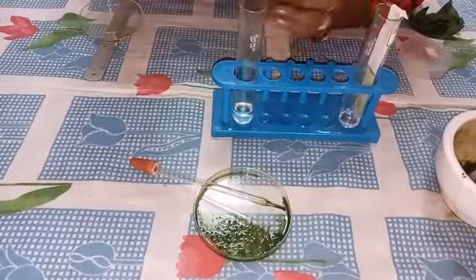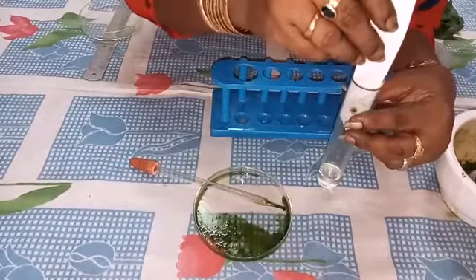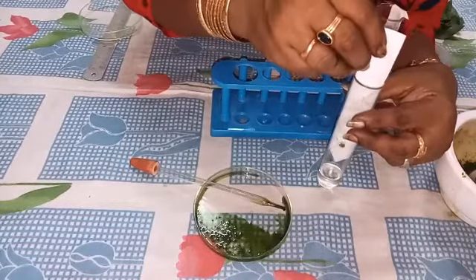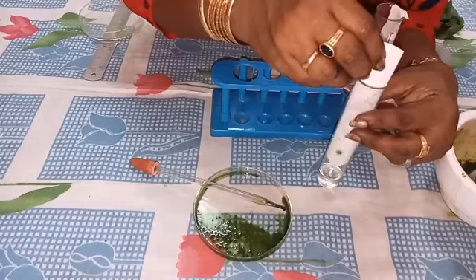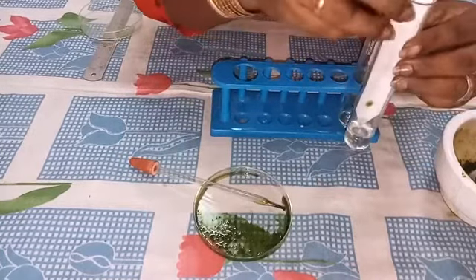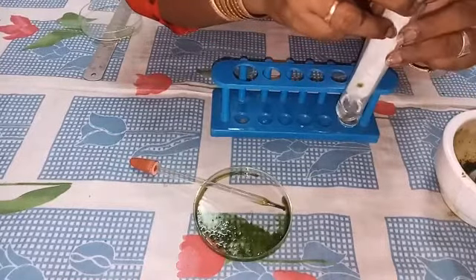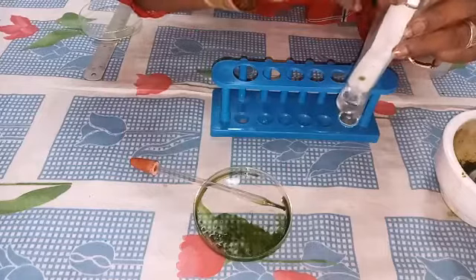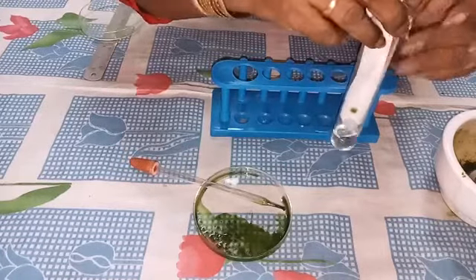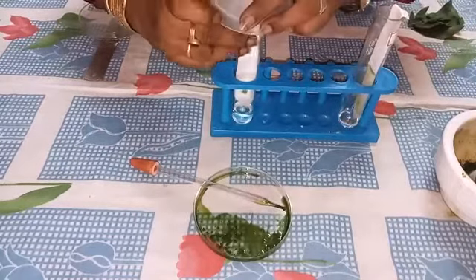Now we must keep the chromatography paper in the test tube in such a way that the tip should touch the surface. Then we have to close and keep it.